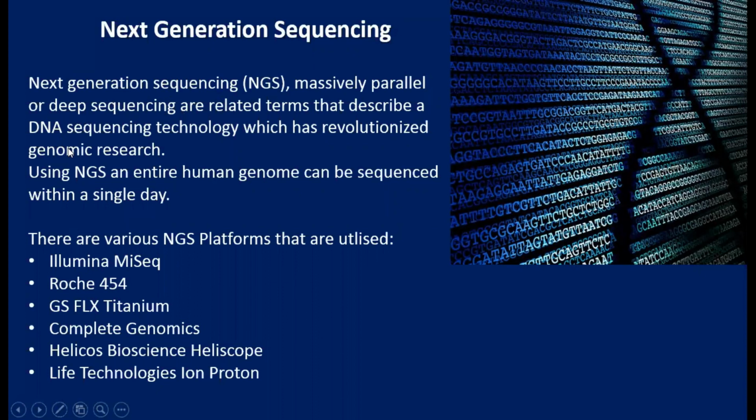And then using NGS, basically people have created whole genome sequences based on that, and you can sequence a huge set of data, like megabytes and gigabytes of data. You can simulate and sequence those data in a really short amount of time.